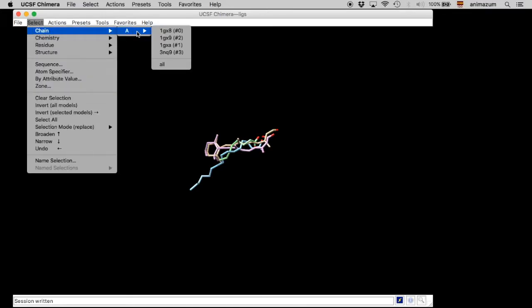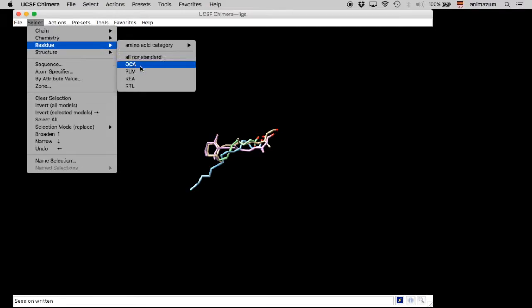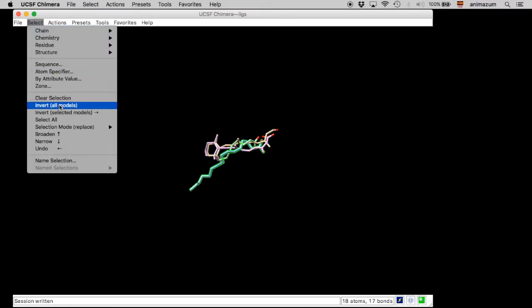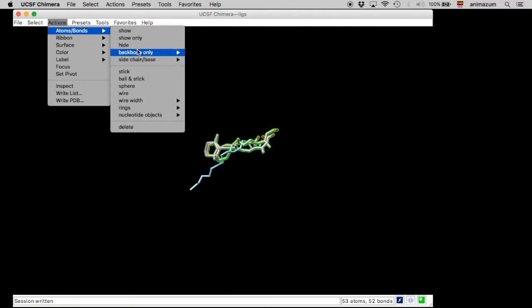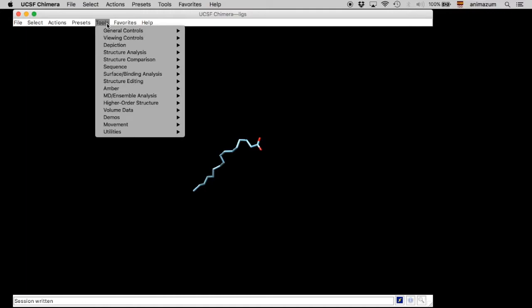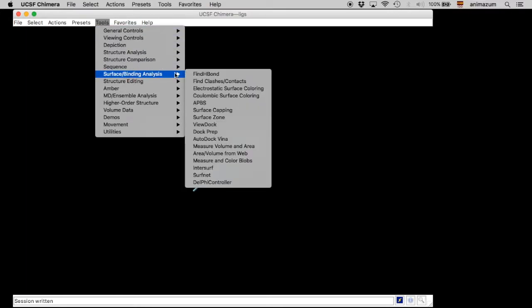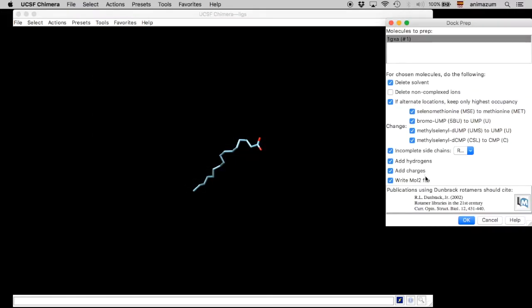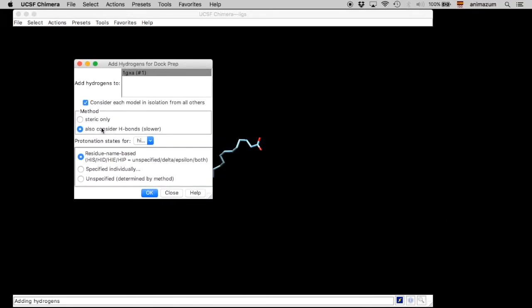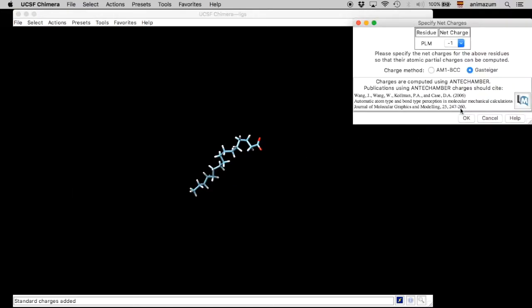Select the ligand. We are going to select the palmitic acid, and then erase the rest because we have to prepare each ligand separately. You can see that it is alone. Using the same tool, Dock Prep, we are going to add hydrogen charges and write a mol2 file, using the default parameters.